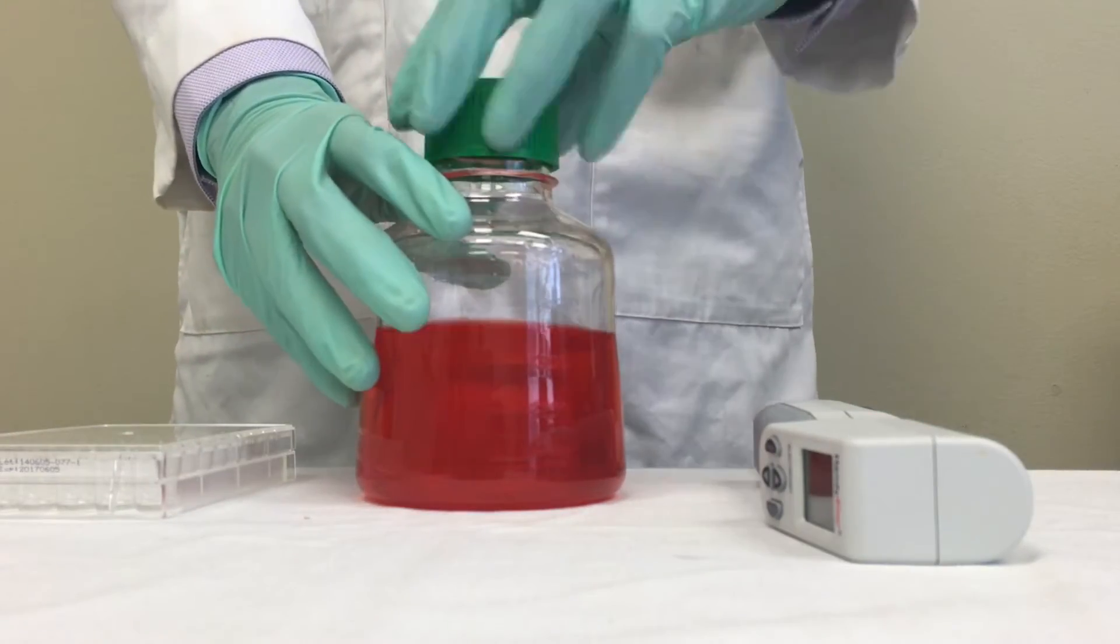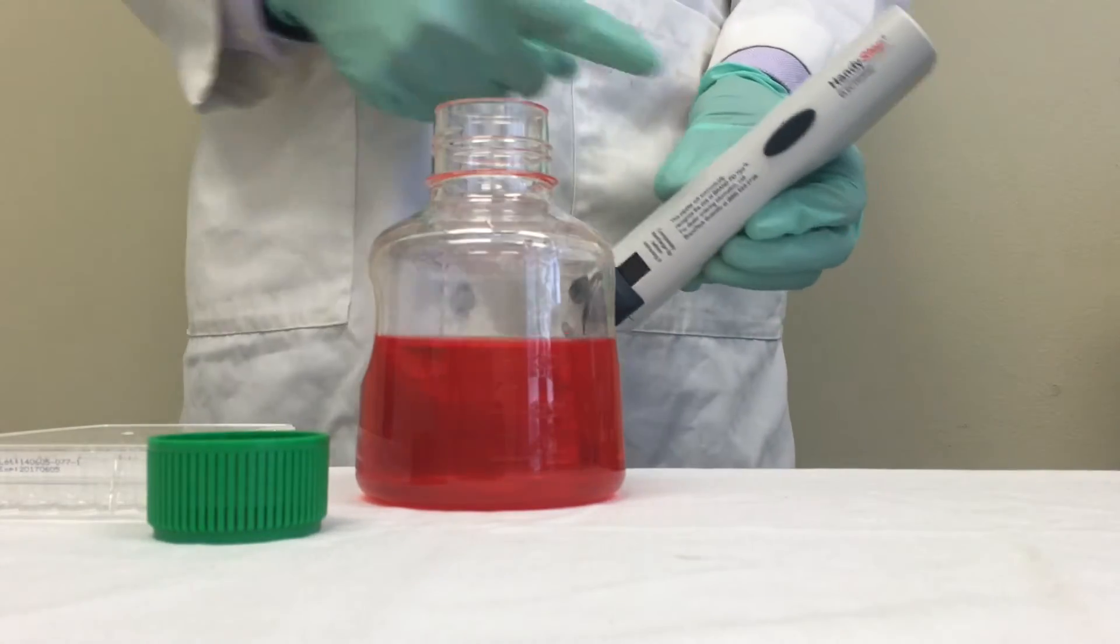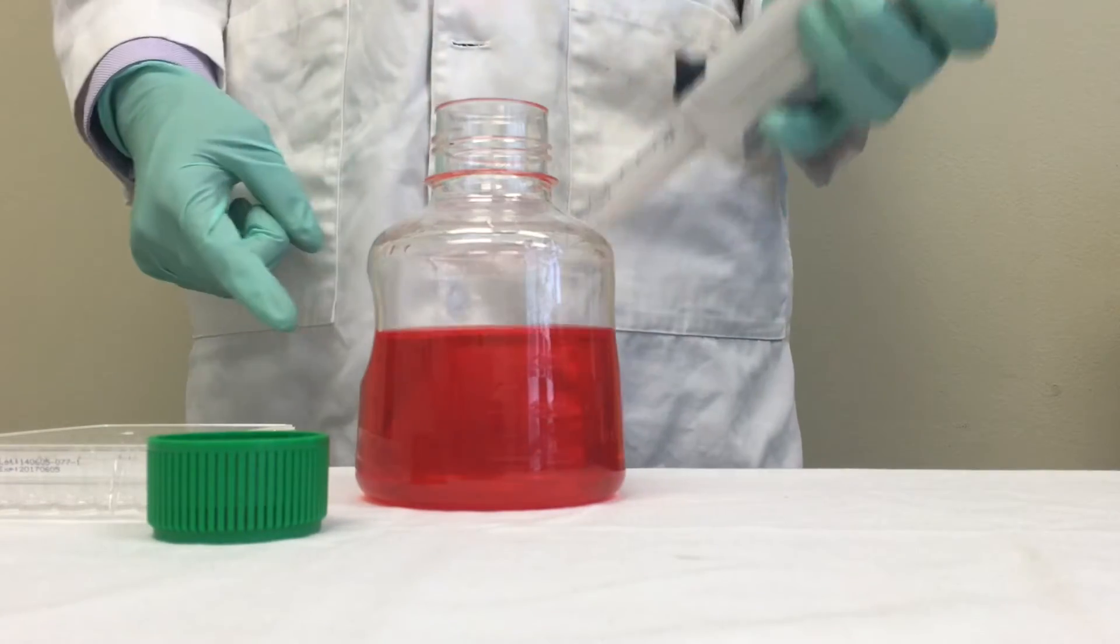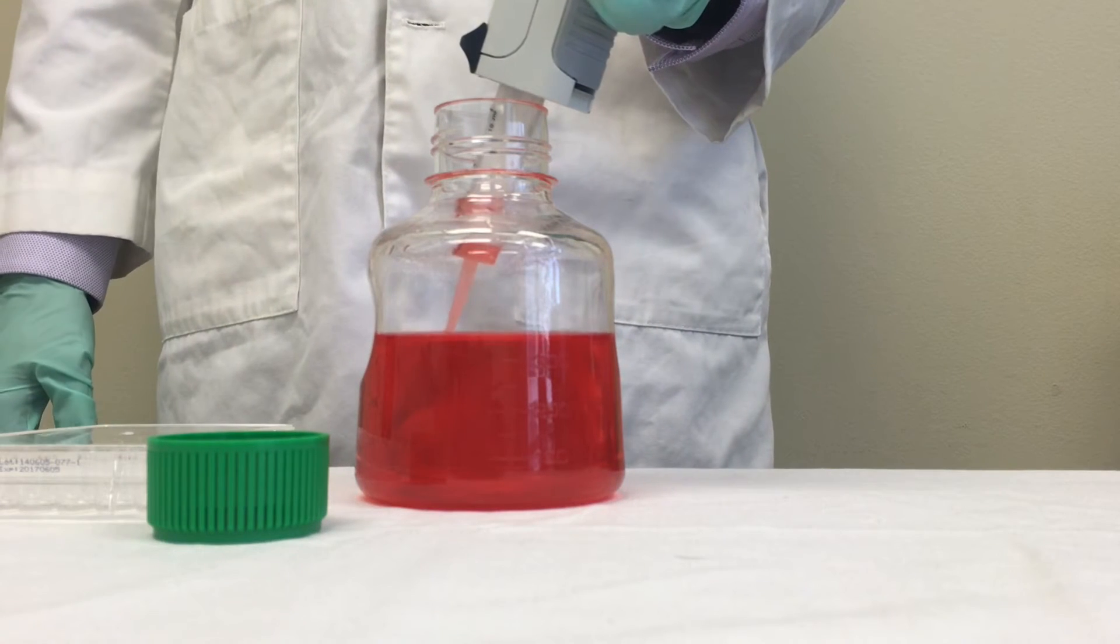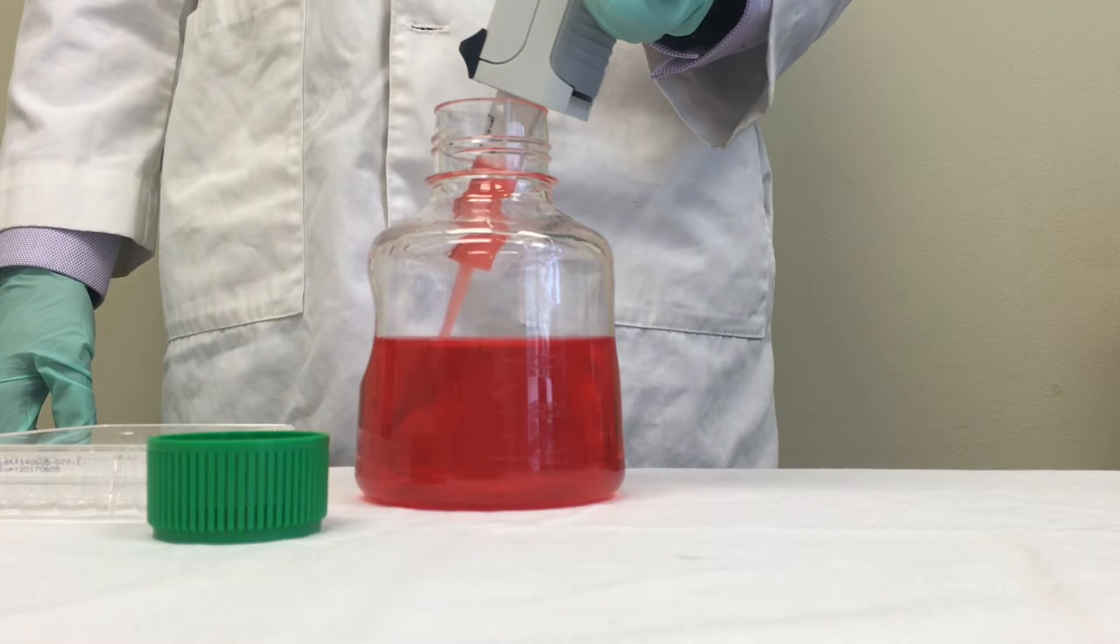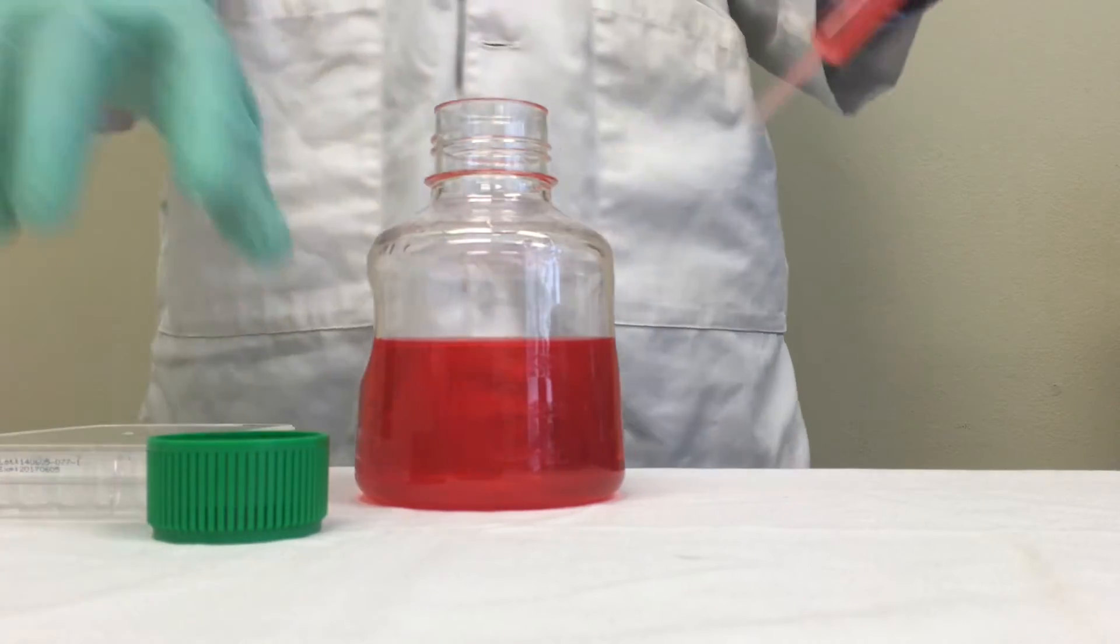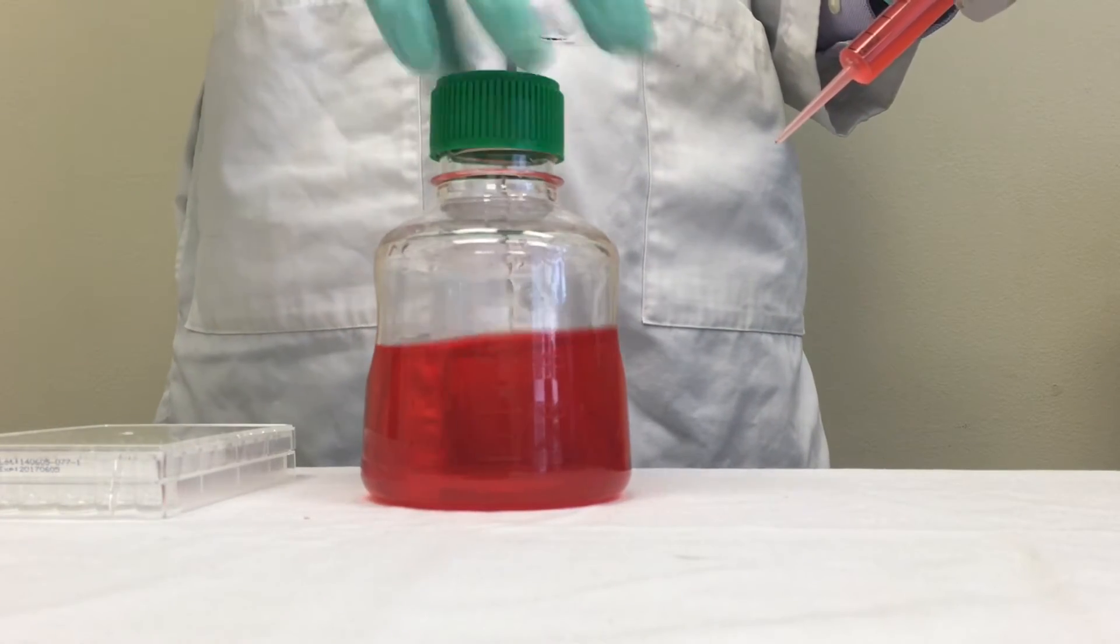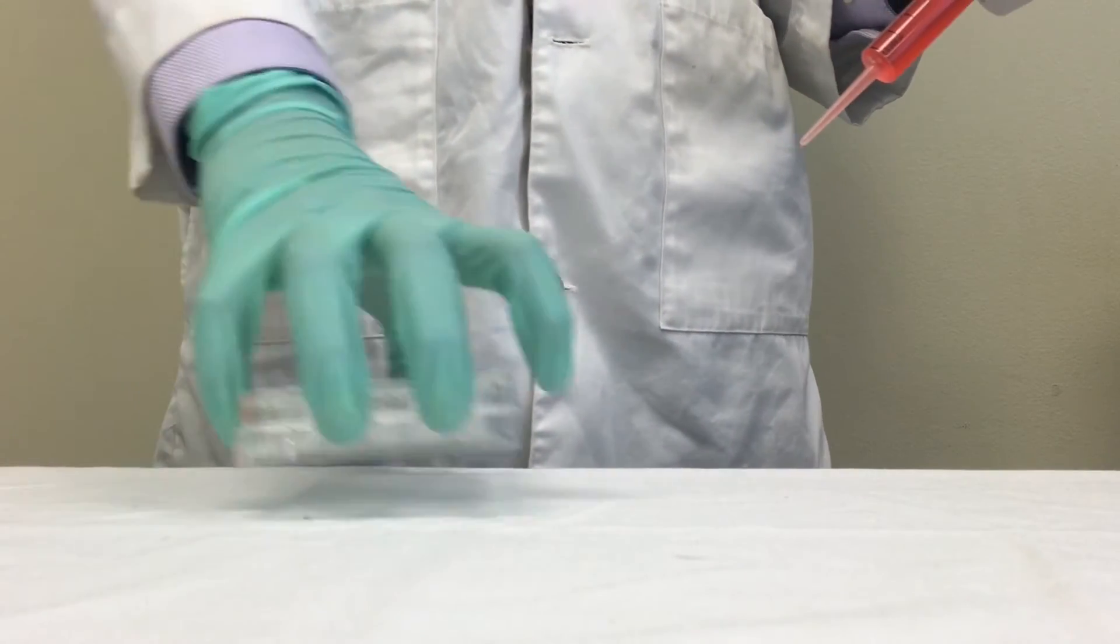To begin aspirating, place the tip of the syringe into the liquid and press the control key one time, and then let the device do all the work. Then, when it is filled up, you can start dispensing.